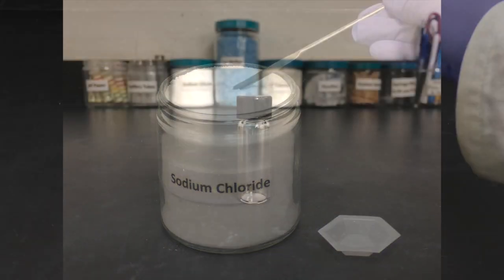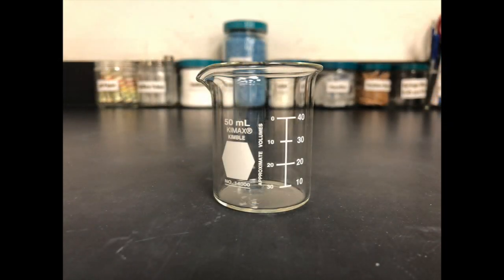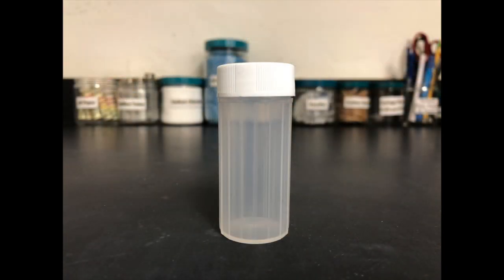You should also use smaller containers, like your one or two dram vials, smaller sized beakers, or a 20 milliliter plastic vial.